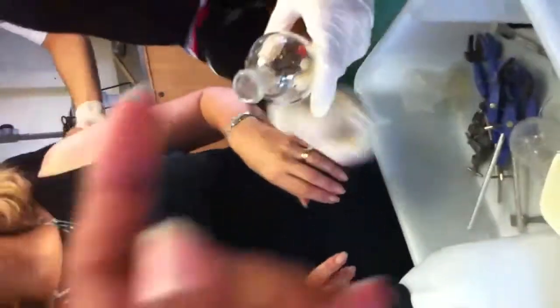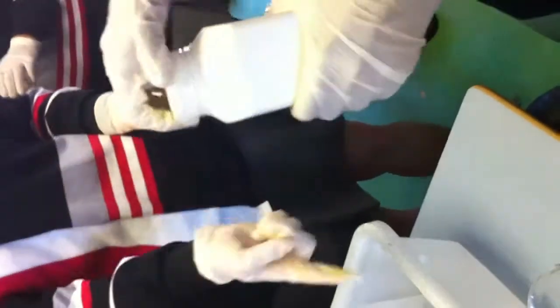It's time to get calcium chloride, miss. It's here, Patrick. No, you have to ask her. Calcium chloride? Yeah. Do we add it from that or from that? What's that? Hot water. Okay, so what do we need to do? You add a bit of it into that. That's it. No water, nothing. Right. Okay. Add a bit of calcium chloride into that.